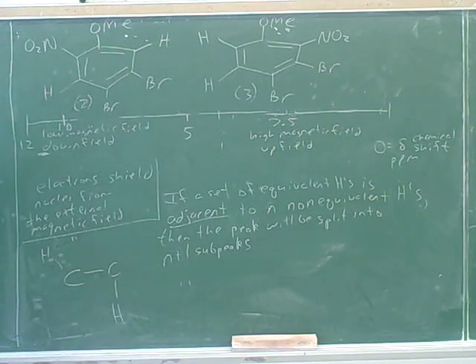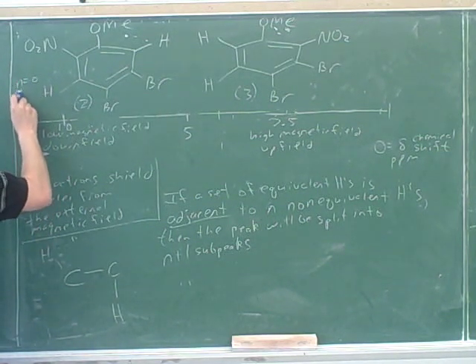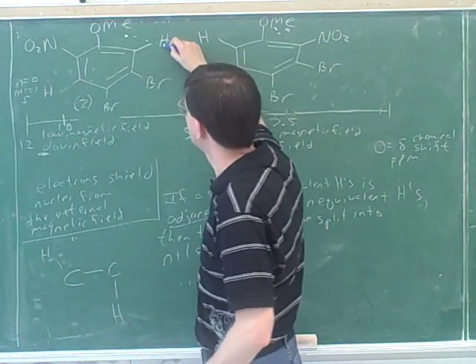The methyl is not the interesting thing to focus on here, so let's not focus on the methyl. It won't be too hard to see which peaks represent the hydrogens on the benzene, because those will have the lower areas. Now, what is N for this hydrogen? 0. So what would N plus 1 be? 1. So what's the name for that type of splitting? A singlet. That's right.